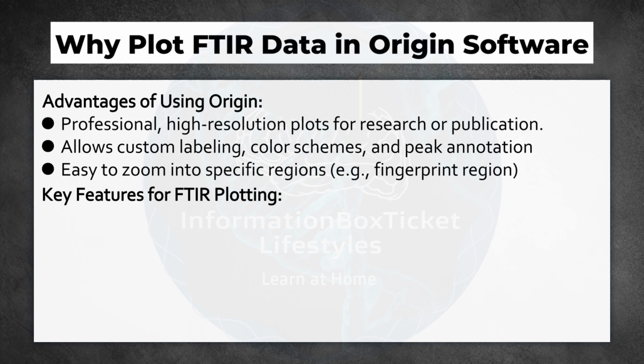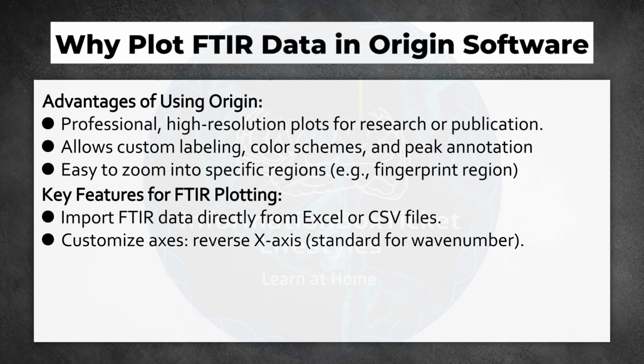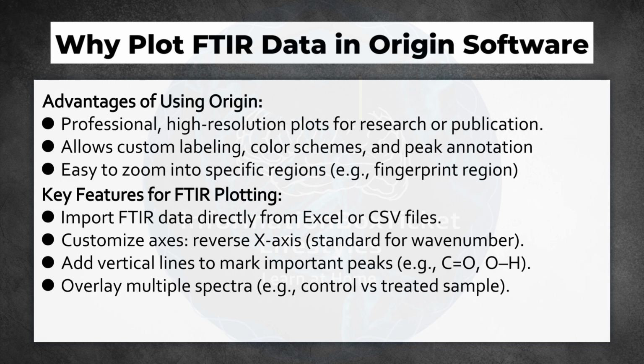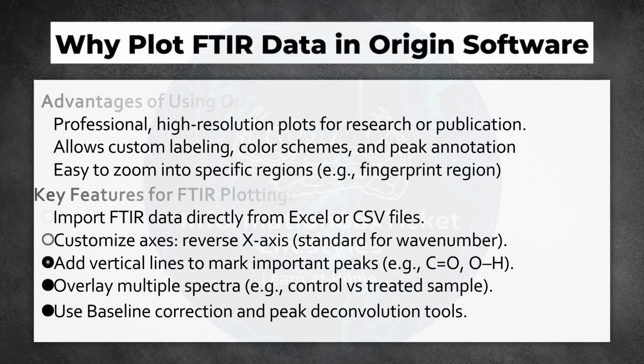Key features for FTIR plotting. Import FTIR data directly from Excel or CSV files. Customize axes. Reverse x-axis, standard for wave number. Add vertical lines to mark important peaks. Overlay multiple spectra, e.g., control versus treated sample. Use baseline correction and peak deconvolution tools.